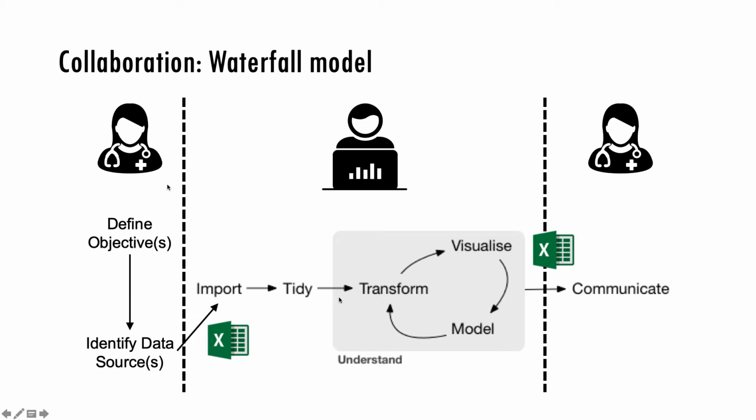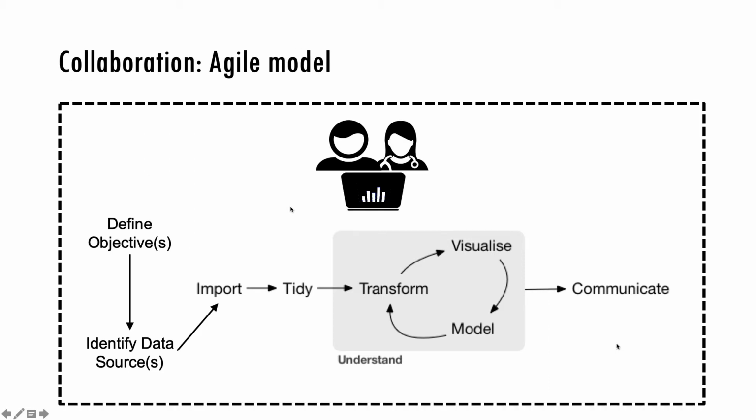Some additional problems are that the data cleaning step may happen entirely without the lab director's input. So this creates a risk that data problems may remain undetected. And also you don't really engage the understand cycle unless there's a lot of back and forth, which is what ends up happening. But you're really not driving this cycle in this waterfall model. So the types of analyses that you can do with this are really limited in sophistication.